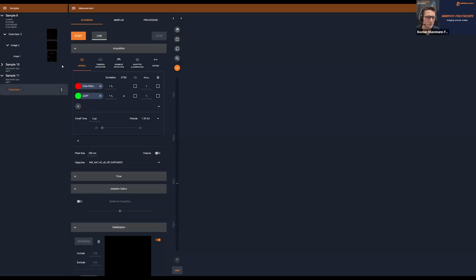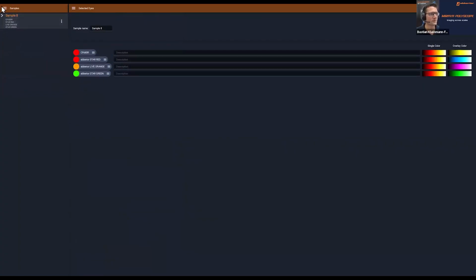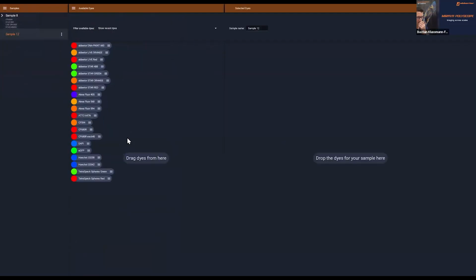Okay, I have to move around here a little bit. We can do it like this. Okay, so now I will define a new sample. Get rid of this and this. Keep this for later reference. And then I can define a new sample here.